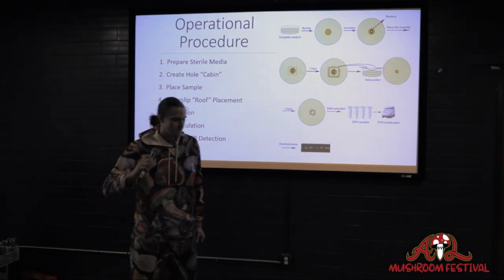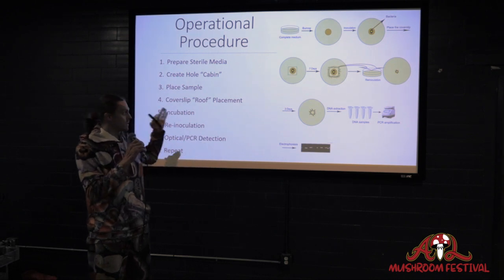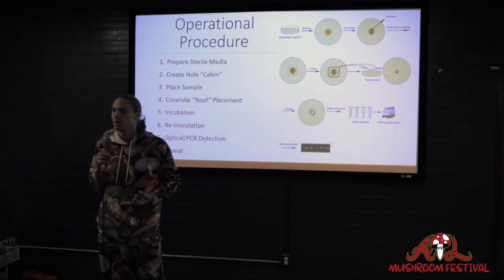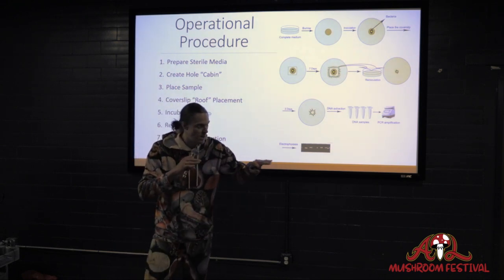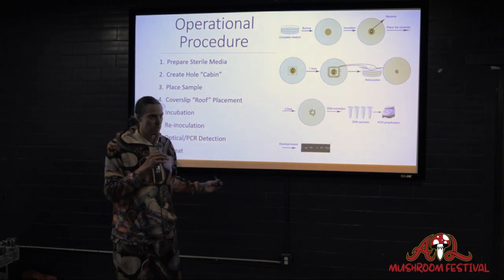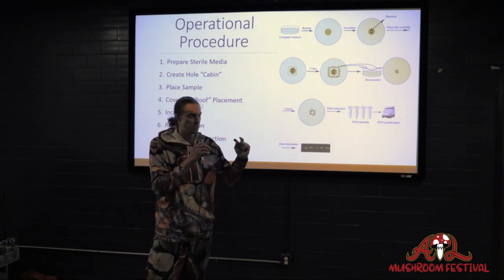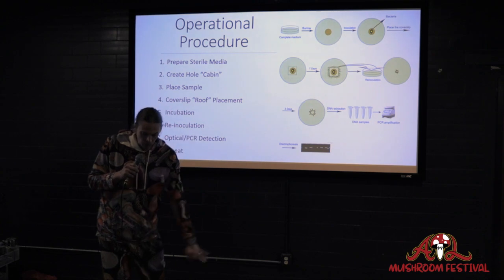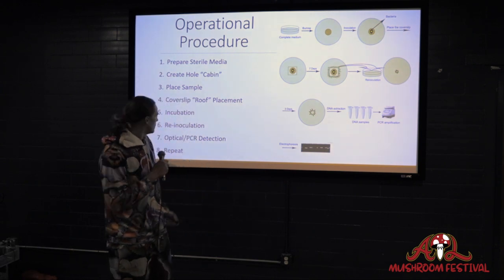Sorry. No worries. Okay. And so what they would do with this gel electrophoresis is be able to see whether the DNA was amplified or it was not amplified. And that's how they were able to tell whether the technique worked or not. And so with PCR, you run hundreds of cycles sometimes in order to amplify the DNA. So if there's any DNA present at all, it's going to make a ton of it by the end of the process. And so usually through PCR amplification, you can have pretty good resolution as to whether something was present or not. The only way you could get better resolution is through whole genome sequencing. But that's very expensive and very time-consuming. And so gel electrophoresis is simple, low-hanging fruit and is easy for most labs to do and run en masse and not be spending an entire life fortune on doing it.